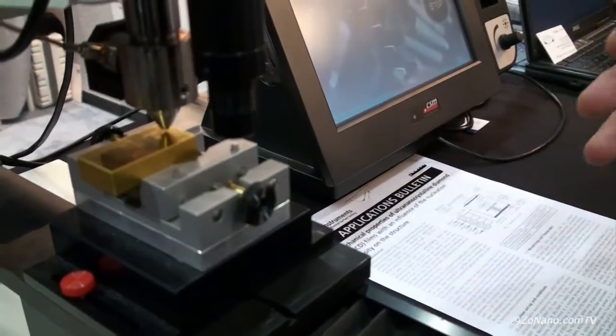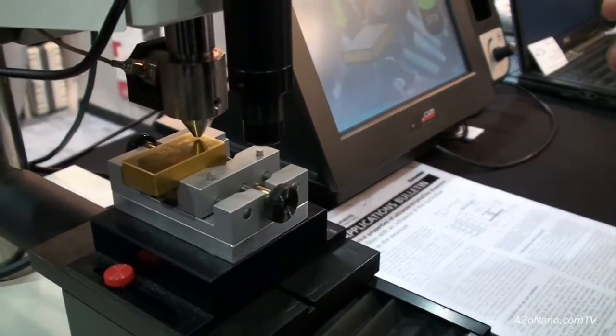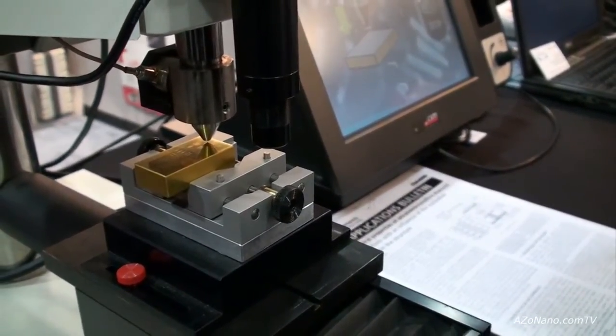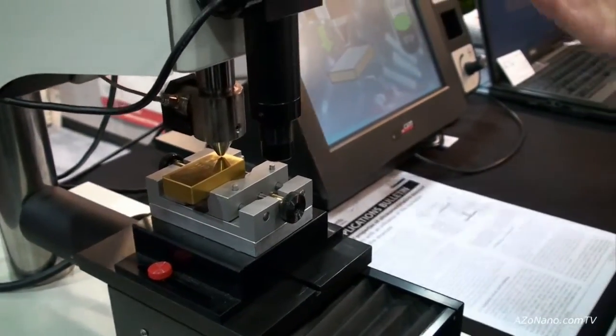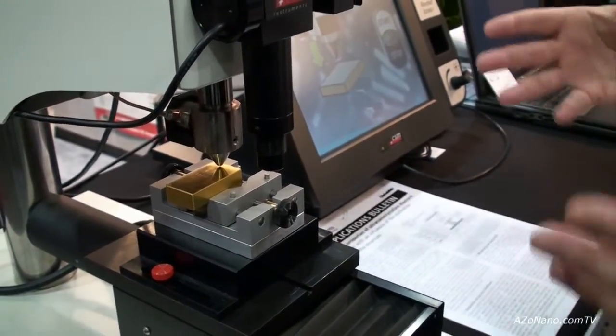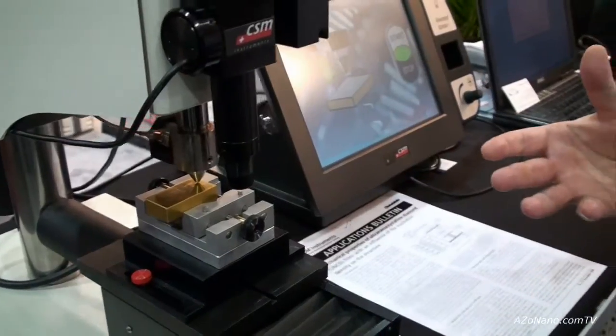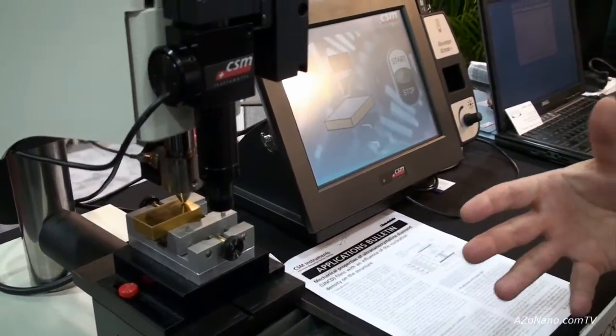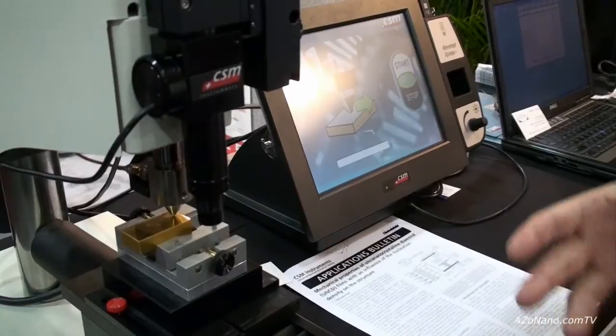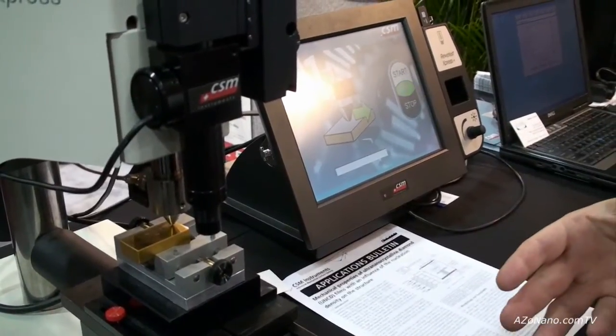What does that mean? It means that at a touch of a button you can scratch your sample and look at the scratch data immediately on a touch screen but you don't have all of the PC and electronics that we had before with our full systems. This means we can reduce the cost and it's a very cost effective system.